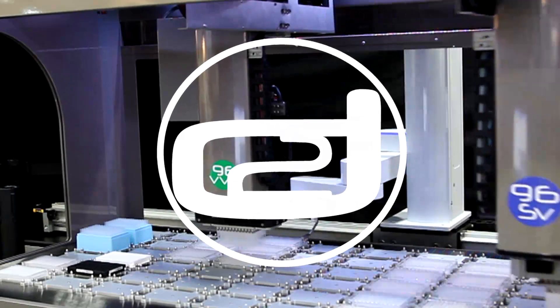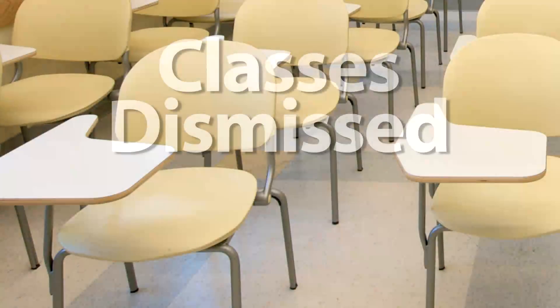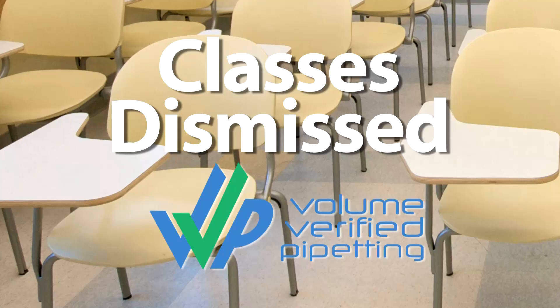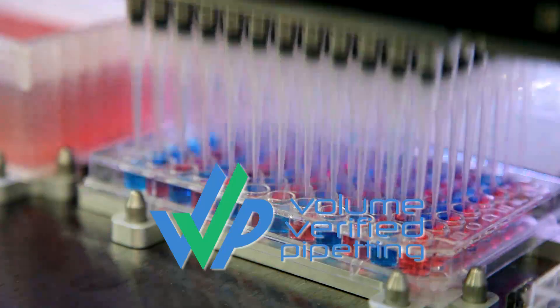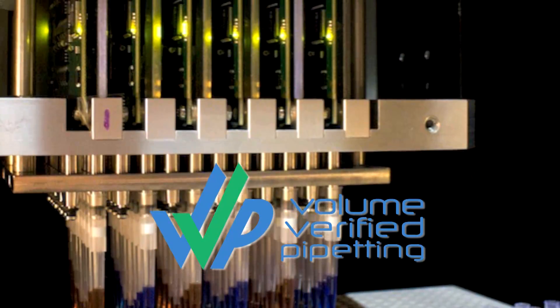Dynamic Devices implementing the latest technology. Classes dismissed — no more liquid class development. The 96 VVP head: 96 individual verified volumes using flow sensor controlled volumetric transfers.